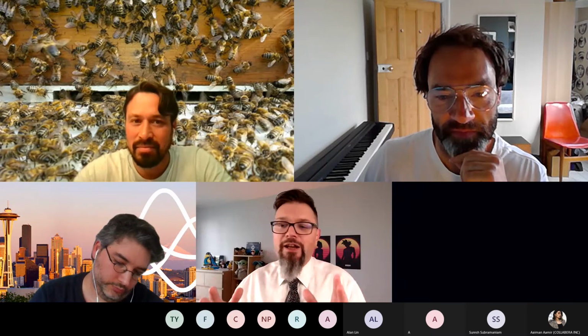I think the answer can be on different parts. For the computer, there's no difficulty except the training. The difficult part is to train and to validate that it's good. But basically, it's difficult just because it's a long process. The laboratory technicians do a lot of operations in order to count and to identify the pollen. We accelerate the end of the process, but there are a lot of operations.